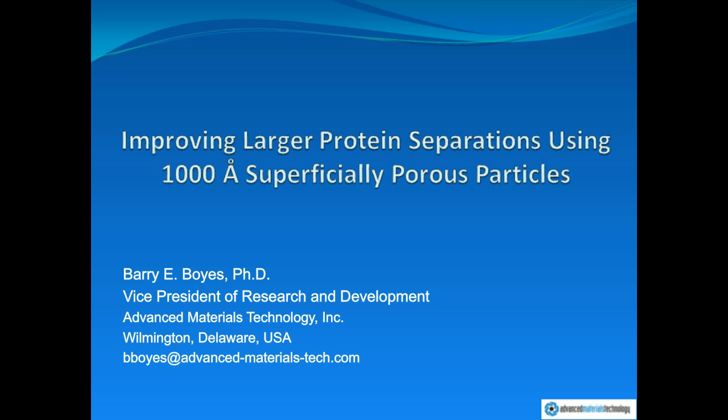The 2.7 micron 160 angstrom material is not something that we actually make commercially. We used it specifically as a prototype to look at the effects of pore size and particle size. And with IgG, for example, with a monoclonal antibody, the performance there with 160 angstroms is really inferior to what you see with 1,000 angstrom or even a 400 angstrom pore size material.